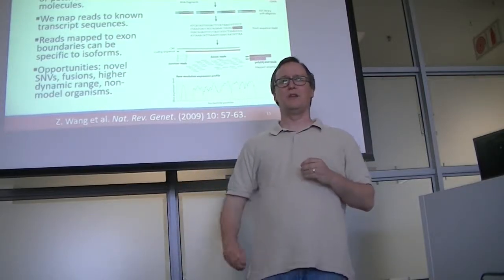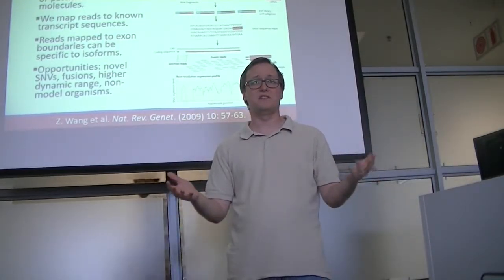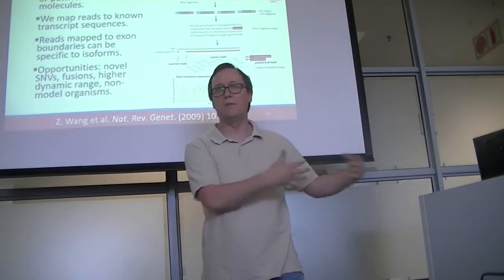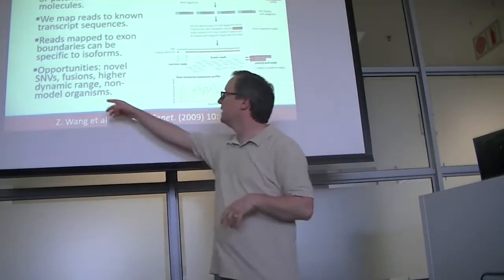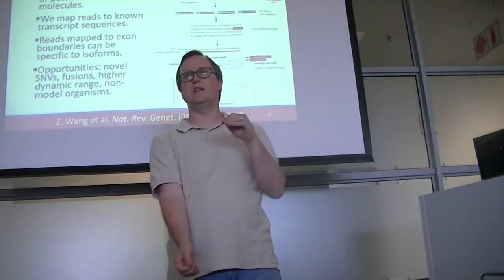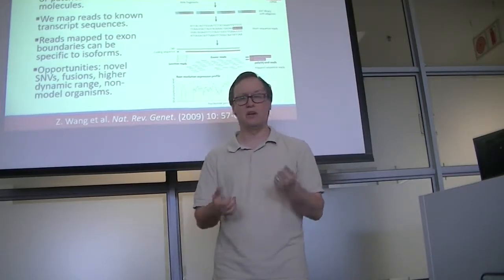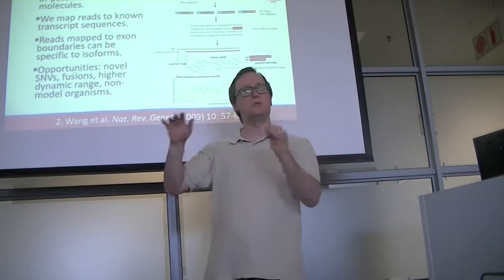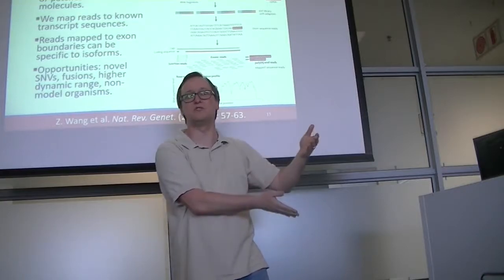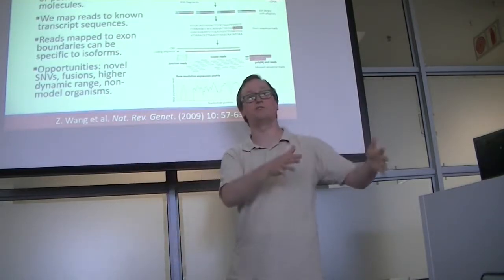High dynamic range. So, as I mentioned, our ability to tell whether a gene is way up or way down is possible under both of these methods. One is using light from the fluorescent dye to make that measurement, and the other one is sequencing individual messenger RNA molecules, or cDNA molecules. However, we find that when there's a really big difference in intensity between very major genes, like say those for albumin, and those for vanishingly small gene expressions, say those in a signaling pathway, that measurements by microarray are a little less reliable for us, that we can see over more orders of magnitude when we use messenger RNA sequencing, RNA-Seq, as our tool rather than microarrays. So dynamic range is another reason that we would shift to RNA-Seq.